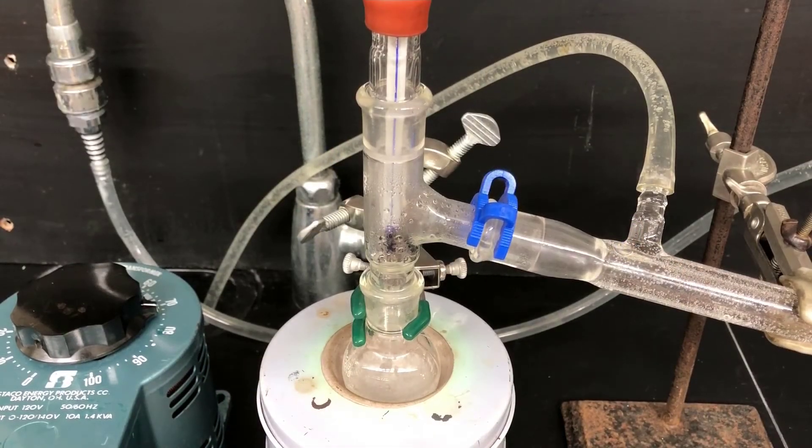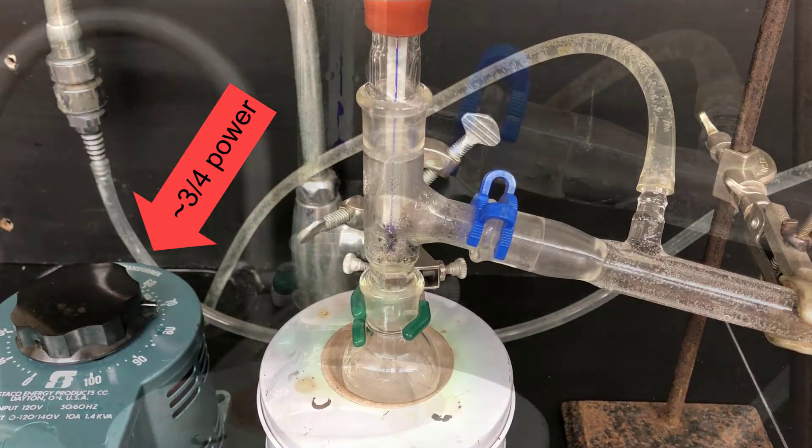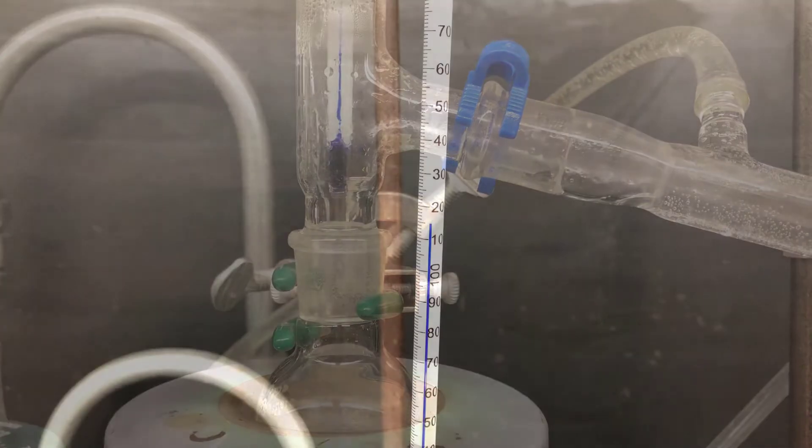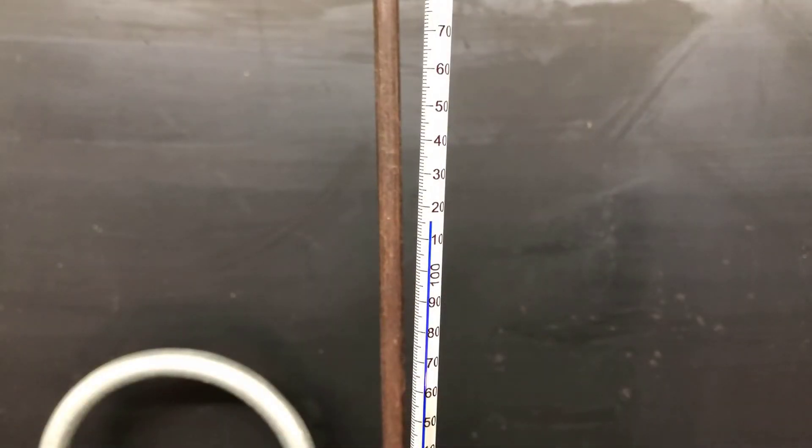Here's a view of the distillation in progress. The aldol dehydration products are much higher boiling than the propanal starting material, so I've set the variable transformer to about three quarters power here. Keep an eye on the temperature of the vapor during the distillation — it should remain below 140 degrees Celsius. If it climbs above that temperature, reduce the amount of heat by dialing back the variable transformer a bit.